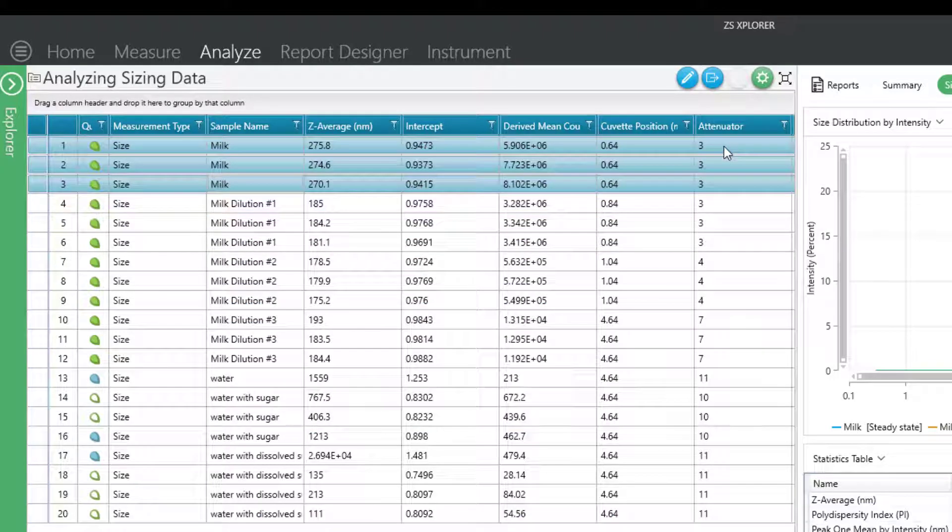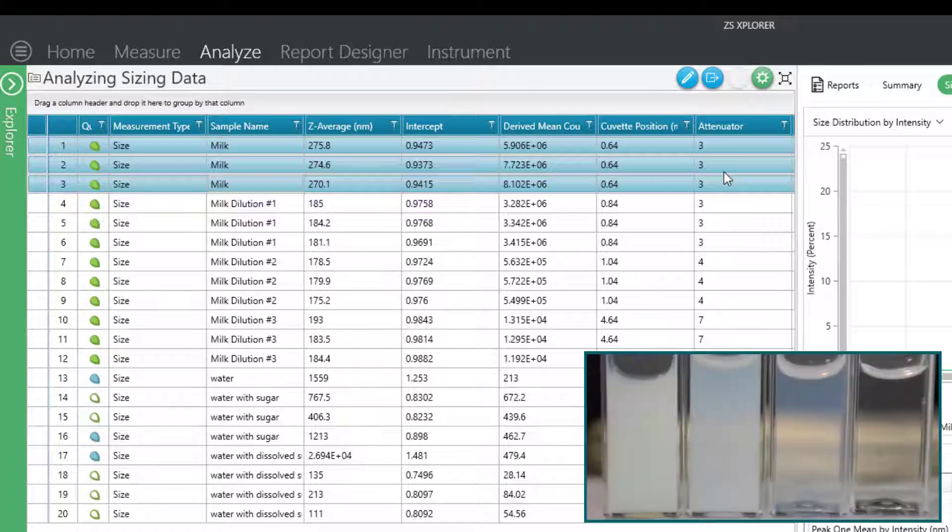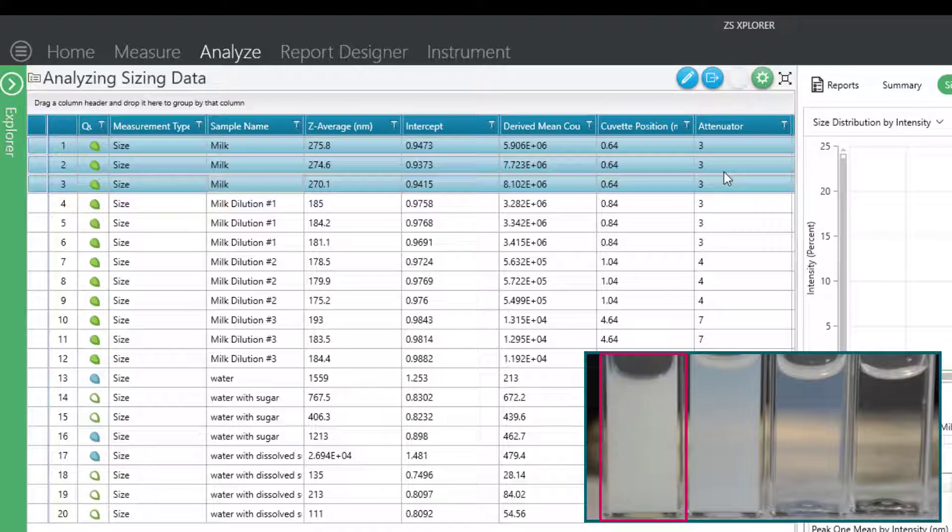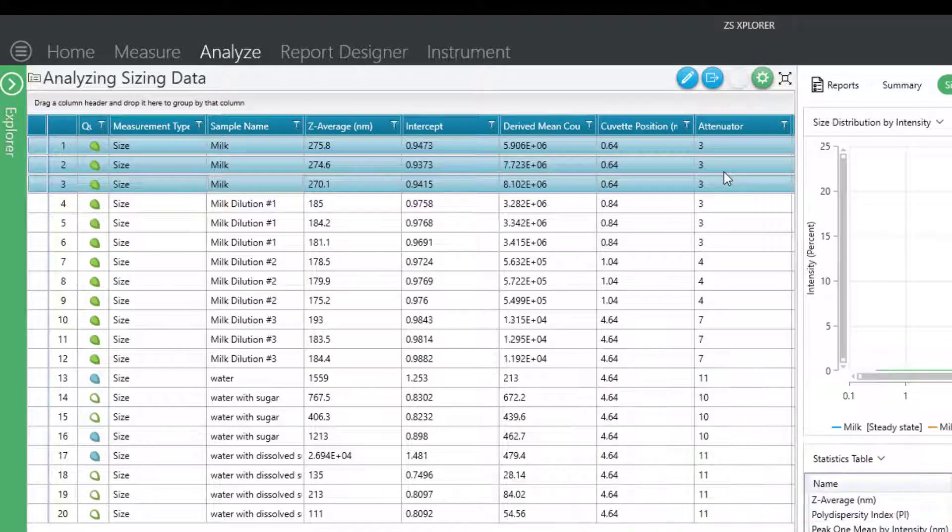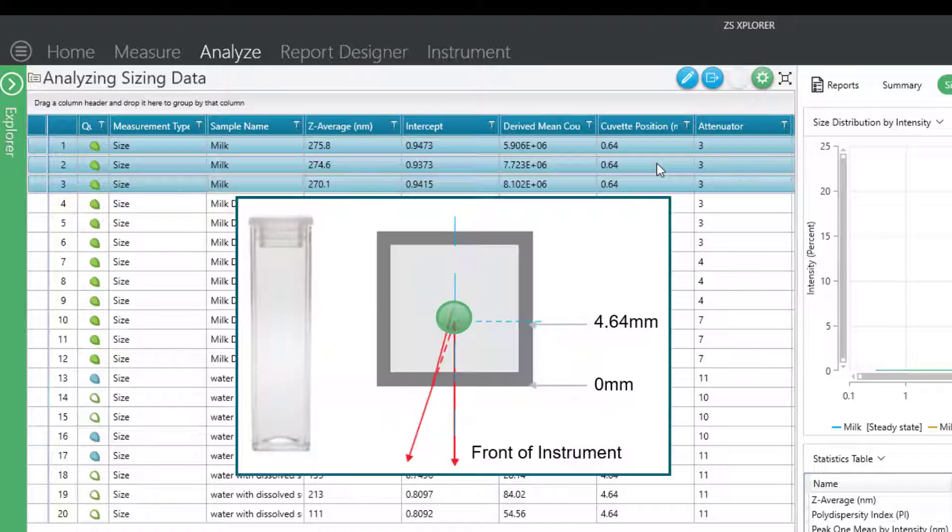So for an attenuator of 3, this means that my sample is pretty concentrated, which we already knew because we could look at the sample and see that it's very cloudy in nature.